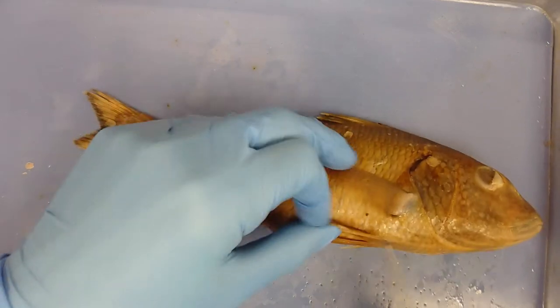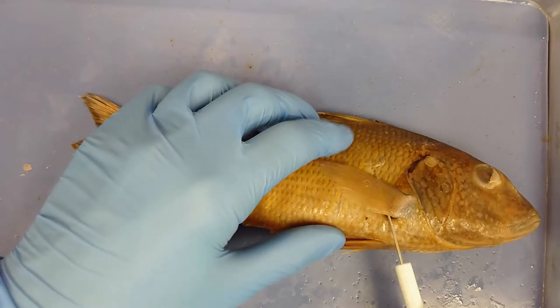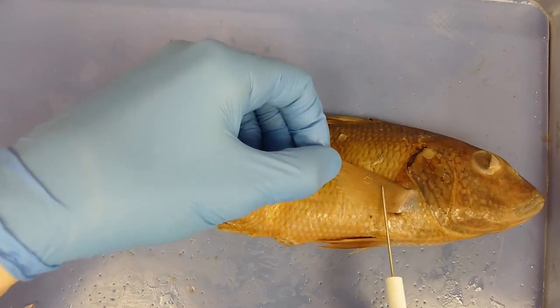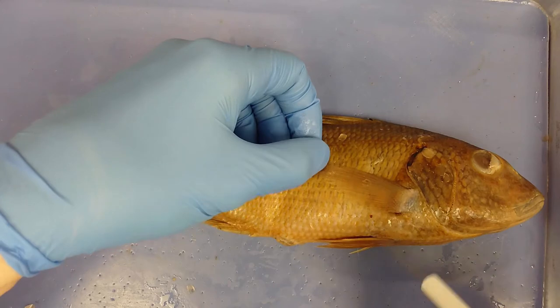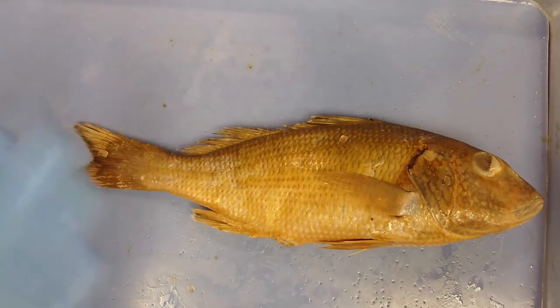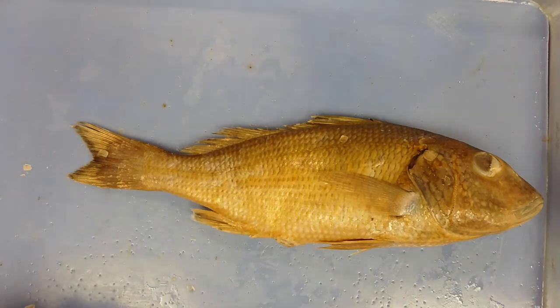Along the middle line of the fish is another set of fins — the pectoral fin. This is used for stability so the fish doesn't fall over to one side or the other while swimming.